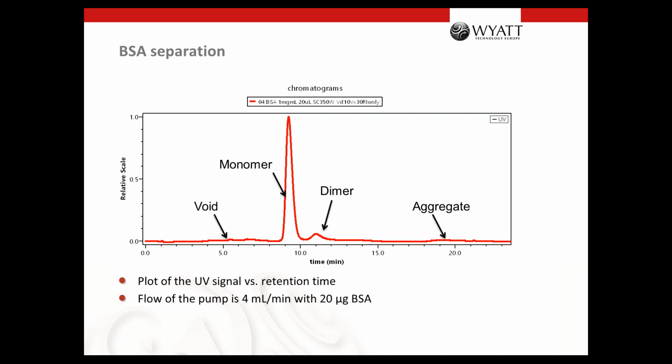And when they elute there, and maybe they anchor a bit on the column bed and so on, then they are also visible with later elution times. And then they can co-elute with your normal sample and disturb your molecular mass distribution. And it also disturbs, of course, the light scattering measurement. And very often with an FFF separation, you can overcome this problem.